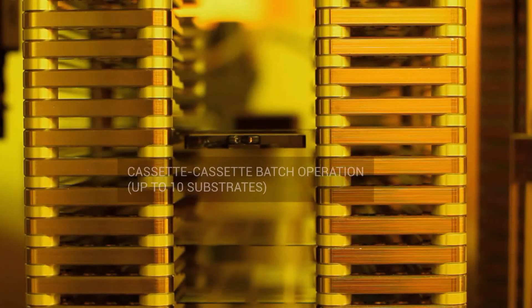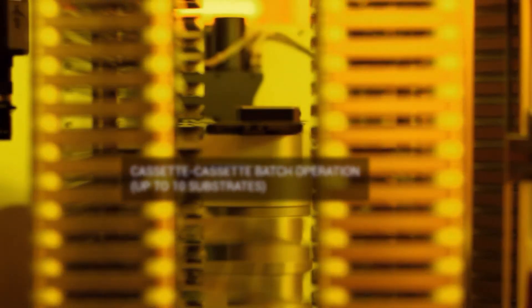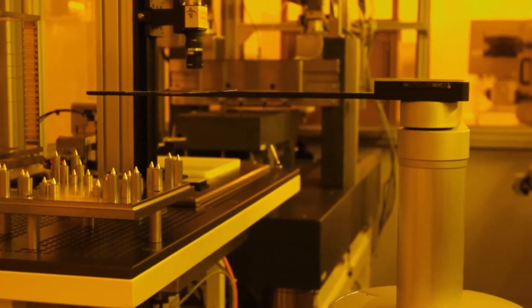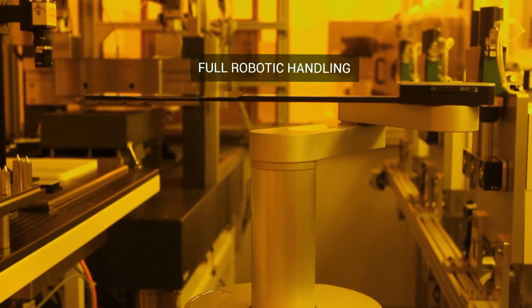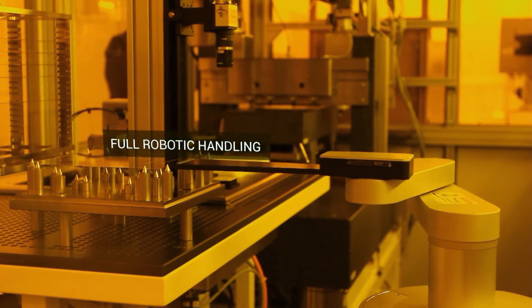Dedicated recipe control and full system data logging allows the user unique system traceability. Substrates are transferred under fully automated robotic control, eliminating manual handling and maximizing process yield and repeatability.